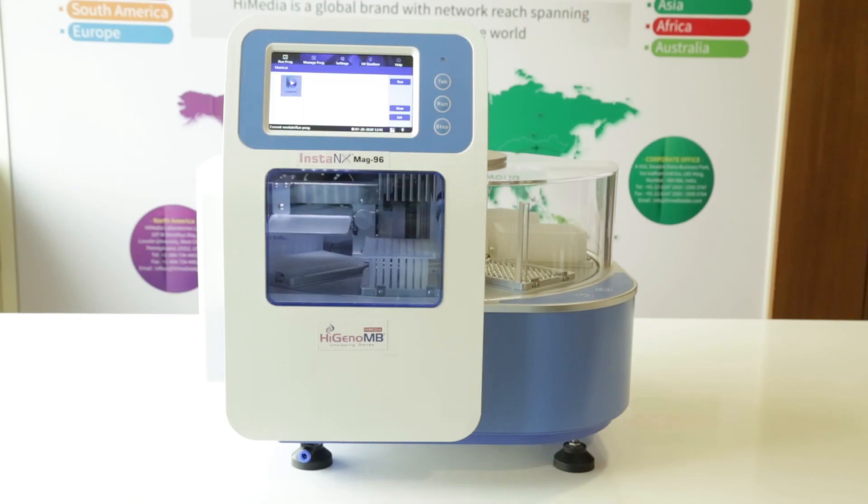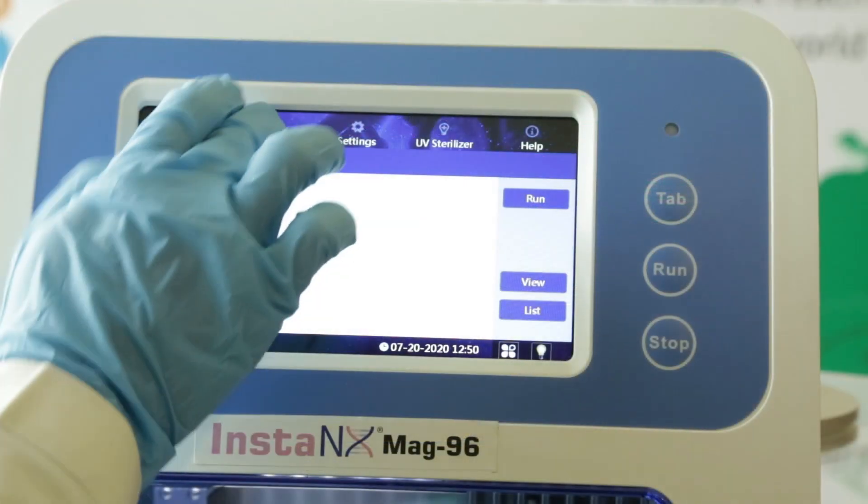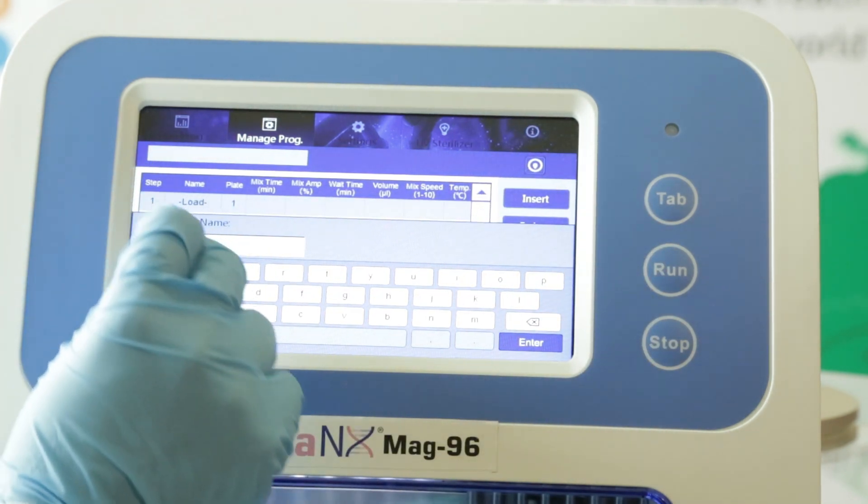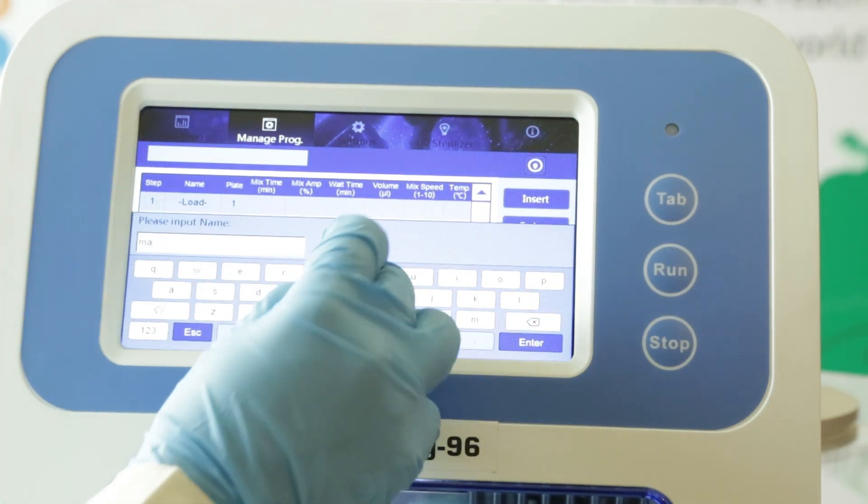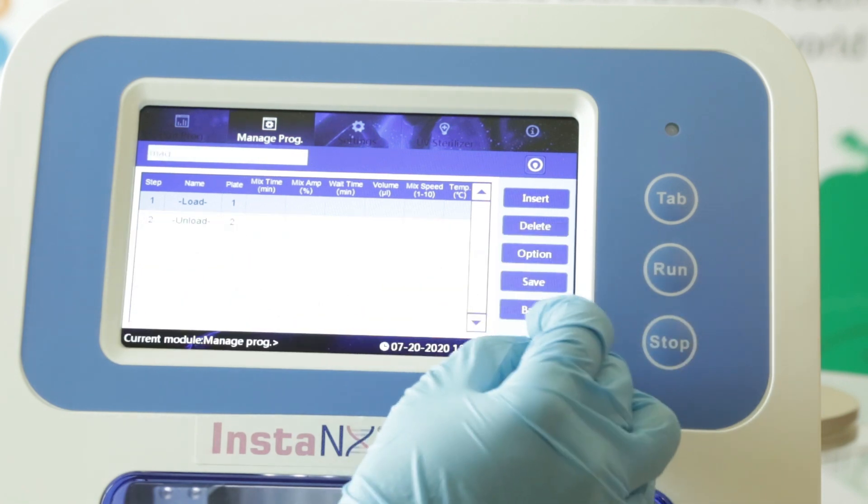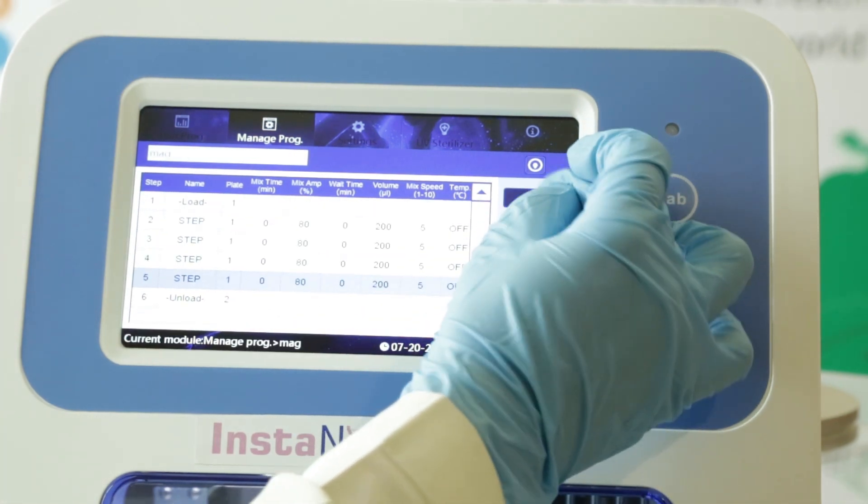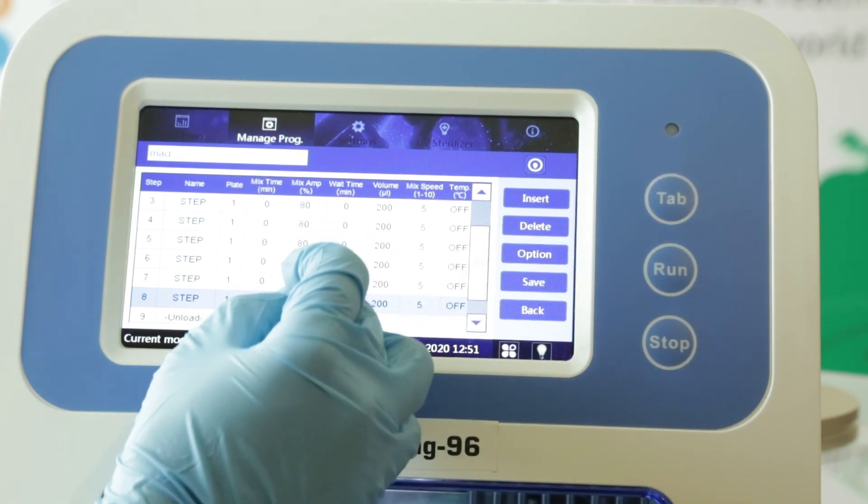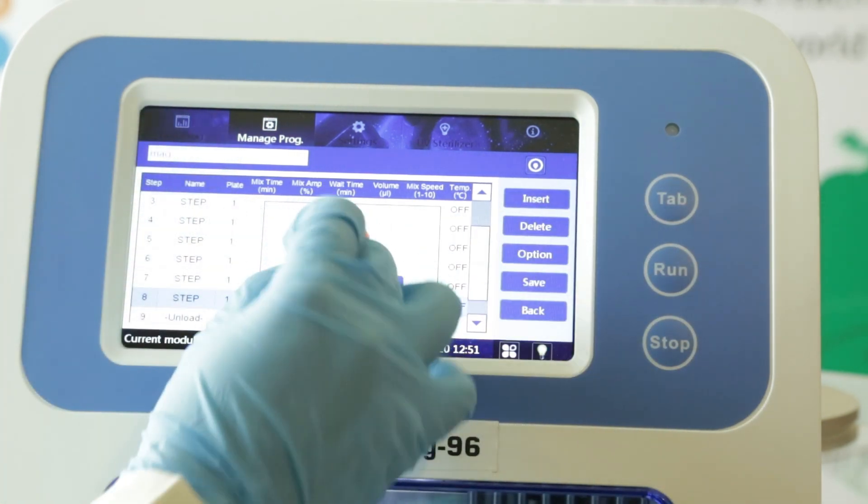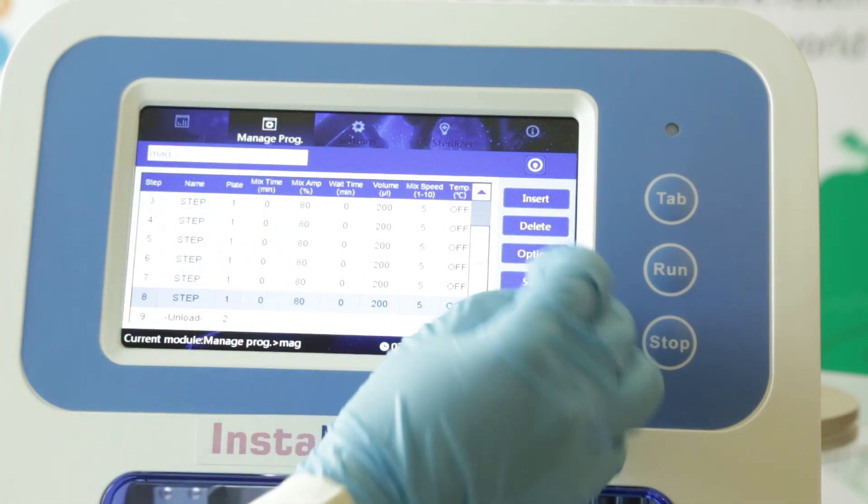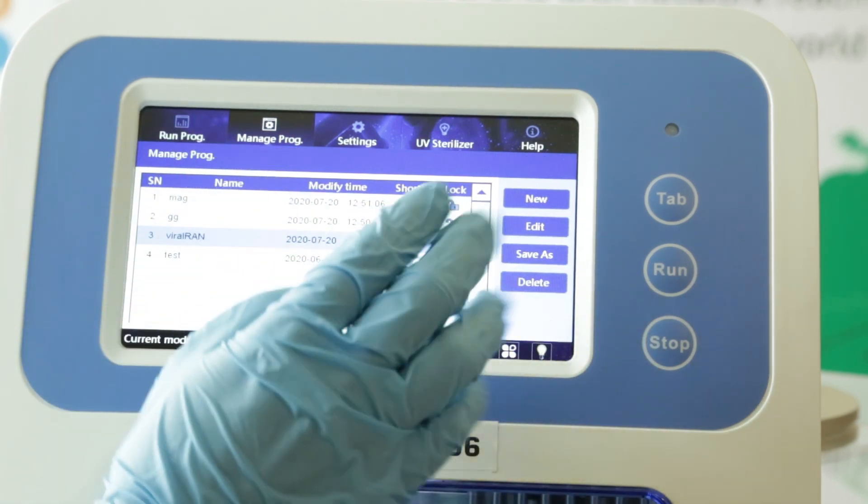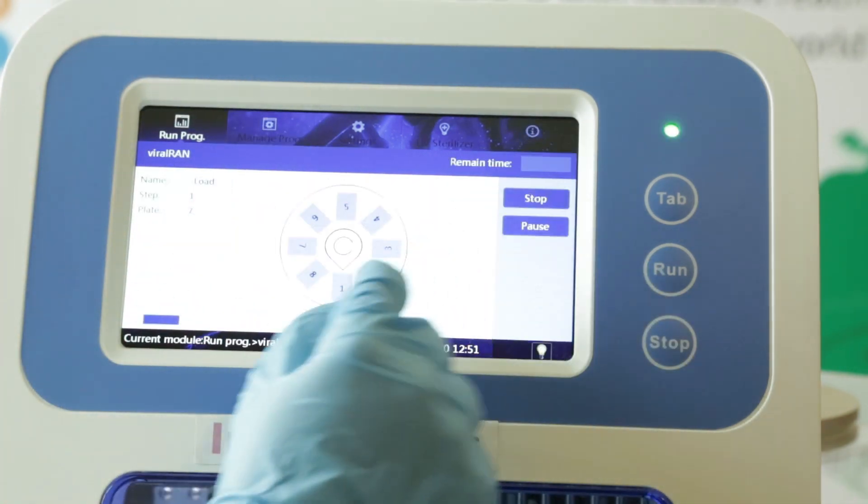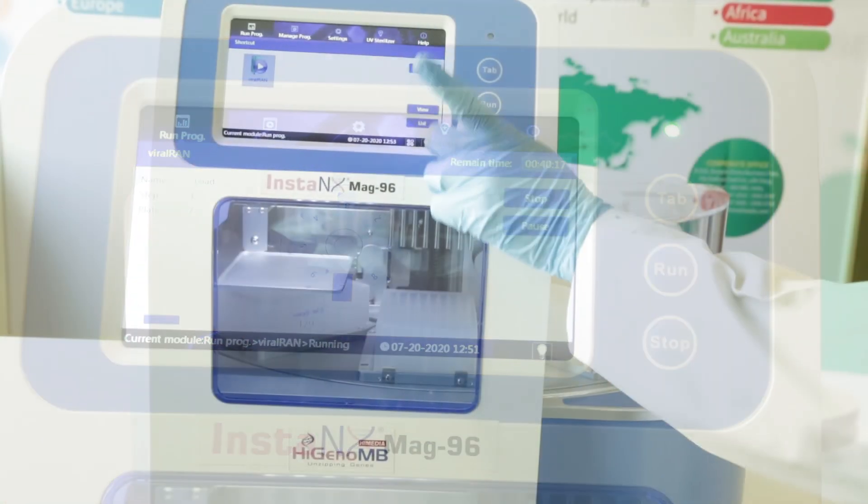HiMedia's molecular biology division launches a brand new series of magnetic bead-based automated nucleic acid extraction systems. InstaNX MAG96 automated nucleic acid extractor is the latest state-of-the-art instrument for processing as many as 96 samples. The 7-inch LED display screen allows the user to set up runs depending on the protocol being used. The versatile and open machine is capable of being programmed based on the kit being used.